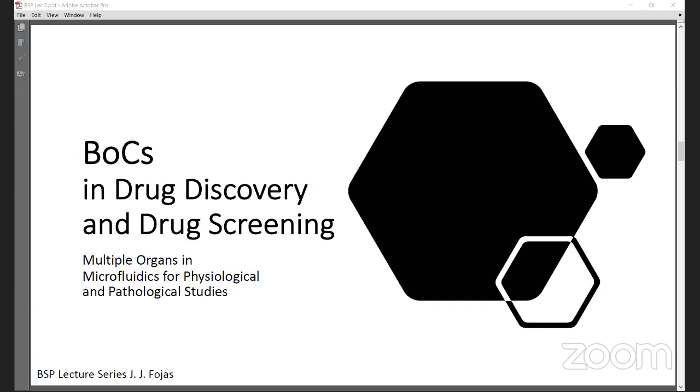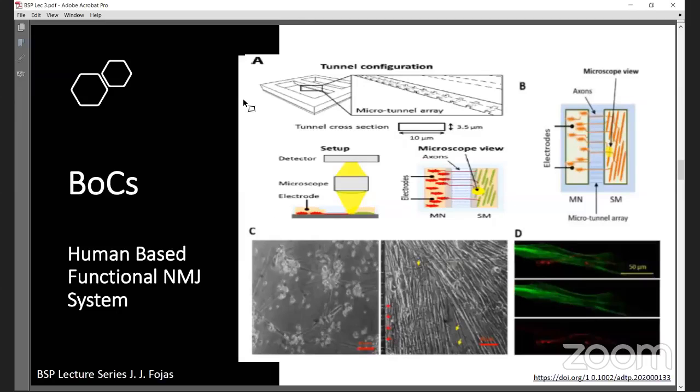Therefore, it is increasingly being recognized that preclinical assessments that are based on animal models often end with poor predictions in many cases, and we need definitely better models. So let's take a look at some of these recent body-on-chips which address these issues.